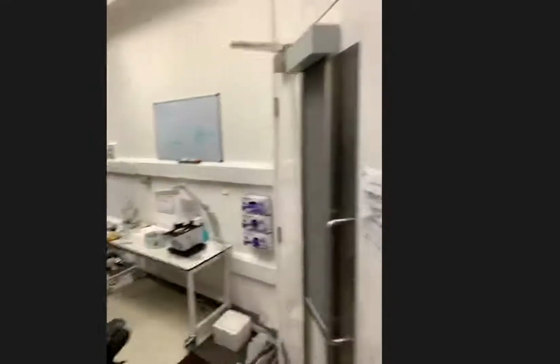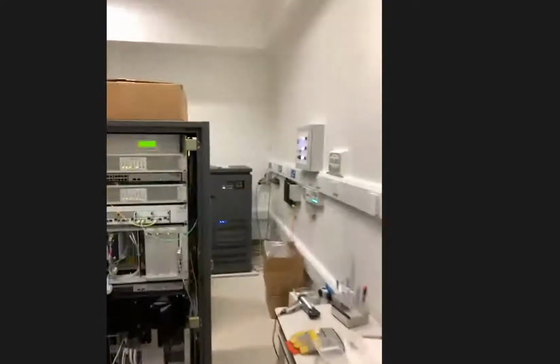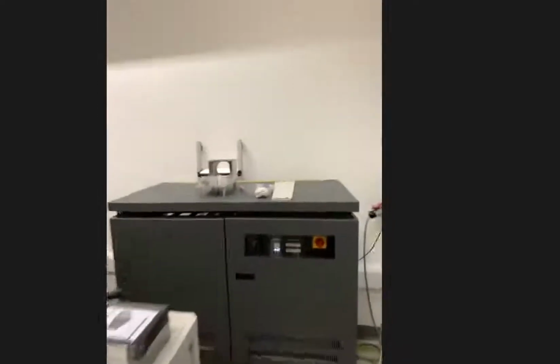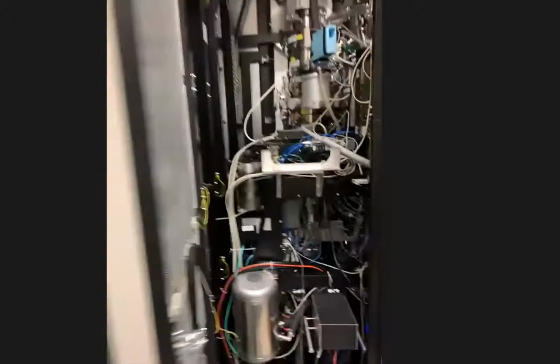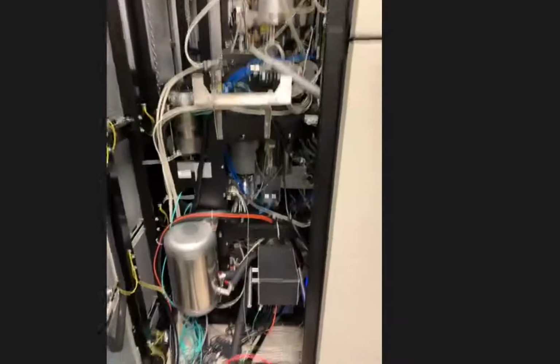And then I hope this is not making you too dizzy, but if we go round the back, you'll see all of the electronics that drive this. There's quite a lot of development done by somebody in the past in terms of the electronics driving it. You can see all of the wires and the cables on the floor. And then if I come here, the facility manager also kindly opened up the back of it for us.